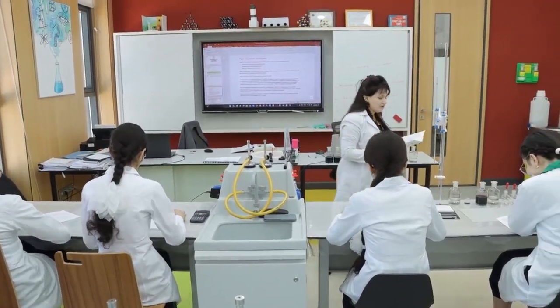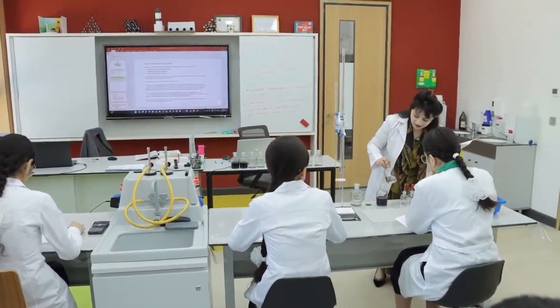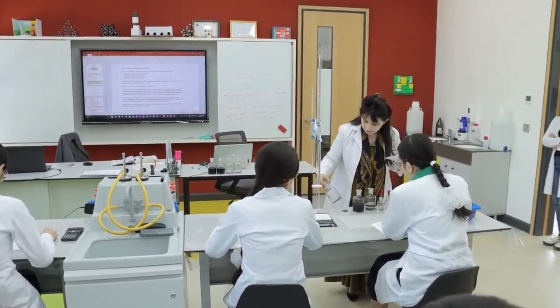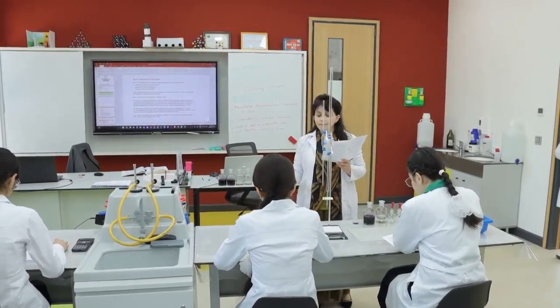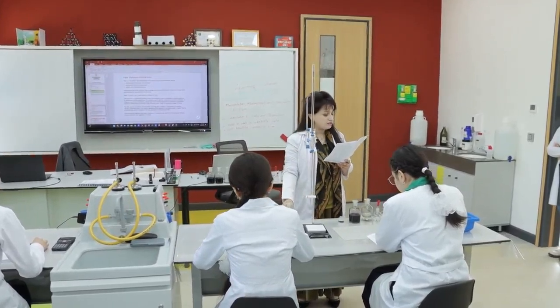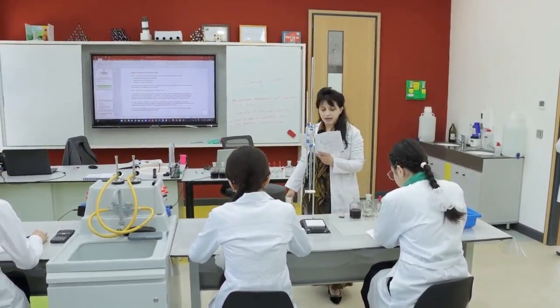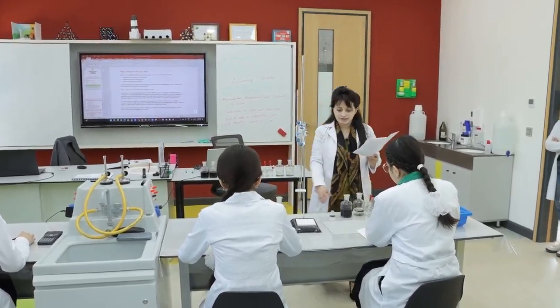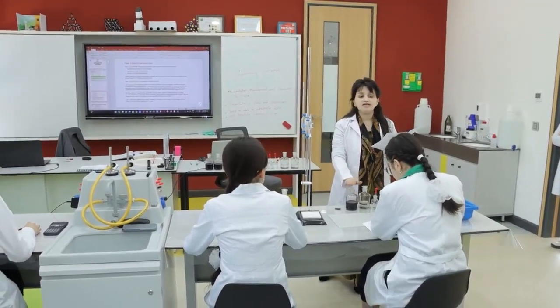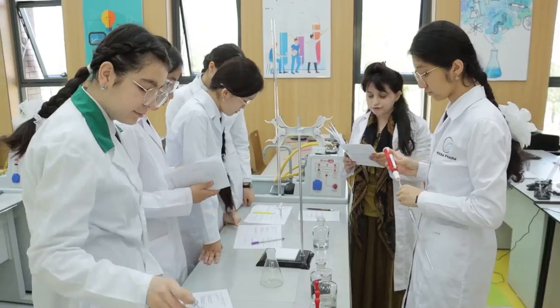FB1, you can see we have provided you with chemicals. FB1 is your hydrogen peroxide. FB3 is also given, that is potassium manganate. And FB4 is the dilute sulfuric acid. All the chemicals are here, so please divide yourself into groups.